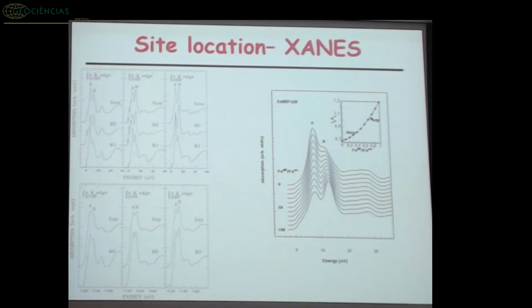Honestly, what should I say? If you have a single crystal, go for single crystal. The occupancy of an element between two different sites is best determined by single crystal. If you then don't have single crystal, you can try powder. The occupancy you get is slightly less accurate. XAS would be the most difficult part to get this information.